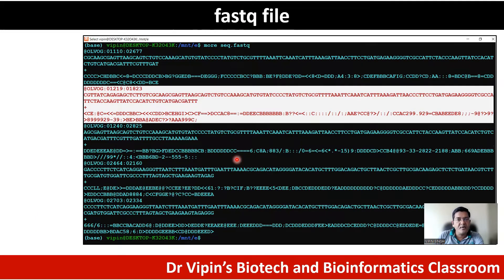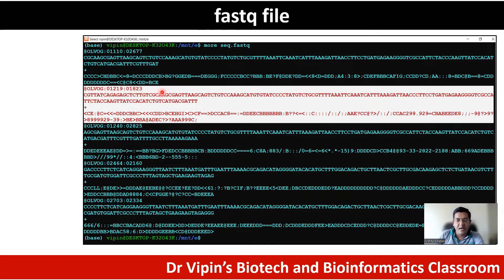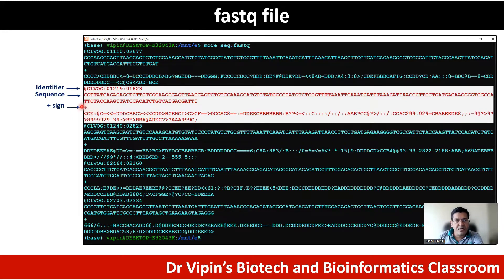If you look closely into the file, you'll see there is a pattern: one sequence record is represented by four lines, as indicated in the white highlighted portion. Within these four lines, the first line starts with an '@' sign followed by a unique identifier — this is the identifier line. The second line represents the nucleotide sequence obtained from the DNA fragment being read. The third line contains only a plus sign, though in some cases it will also have the identifier again.